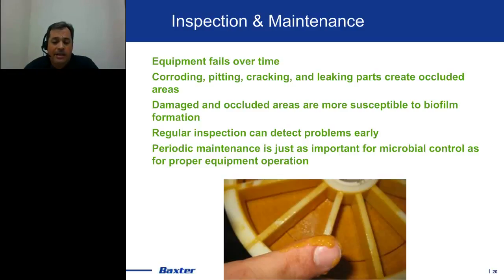The other thing that I've seen done with manufacturing maintenance is also using it for microbial inspection. There was a great presenter from J&J who did some talking about using it in the microbial control strategy, that regularly these systems are opened up, and when they're opened up, it's an opportunity to see what's going on in there.